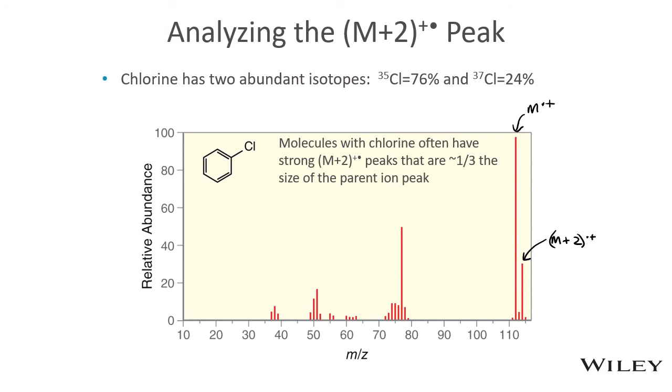And that's because these molecules all contain chlorine-37, whereas these ones contain chlorine-35. So this is really just pattern recognition. If you get a mass spectrum that has this sort of pattern of an M peak and an M+2 that's about 1/3 the size, it indicates that there's a chlorine in the molecule.